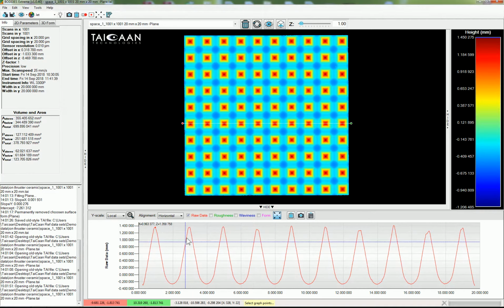Click on that, click on the second pyramid as shown here, and now I have the two positions of the first two pyramids, and I can see in this lower window with the light yellow coloration the distance between those, pretty much exactly 2 millimeters in X. Slight difference in Z because some of these pyramids have slightly different heights, but basically you get the basic geometry of the sample from this.